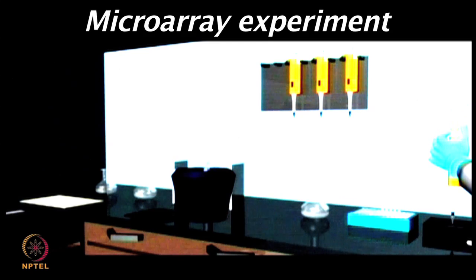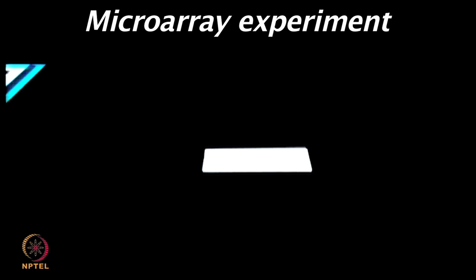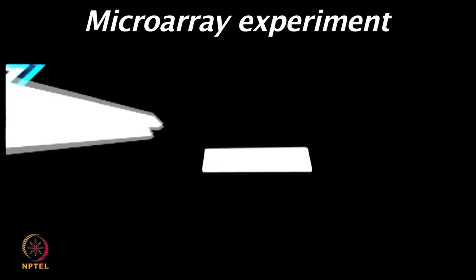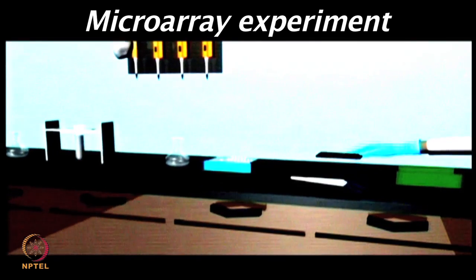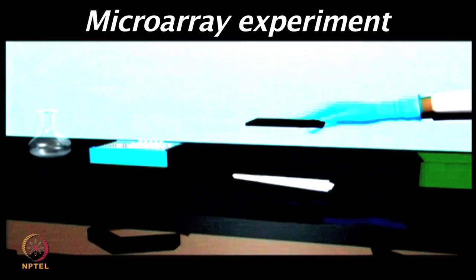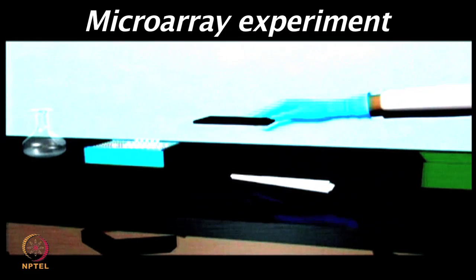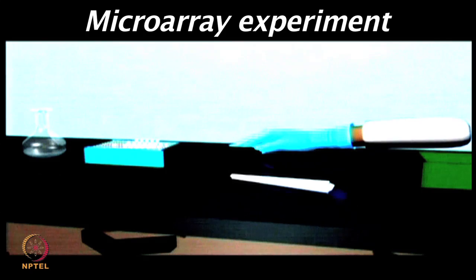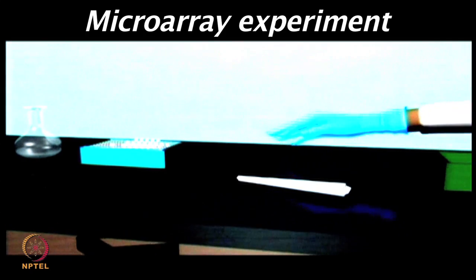Often these conditions are quite similar to the ones used for Western blots. Once you are ready with the appropriate dilution of the serum, then you can apply those on the chip surface and place the cover slip for an hour. Similarly, you can add the primary antibody and then place the cover slip. As I mentioned, these are generic steps which could be used for a variety of applications.